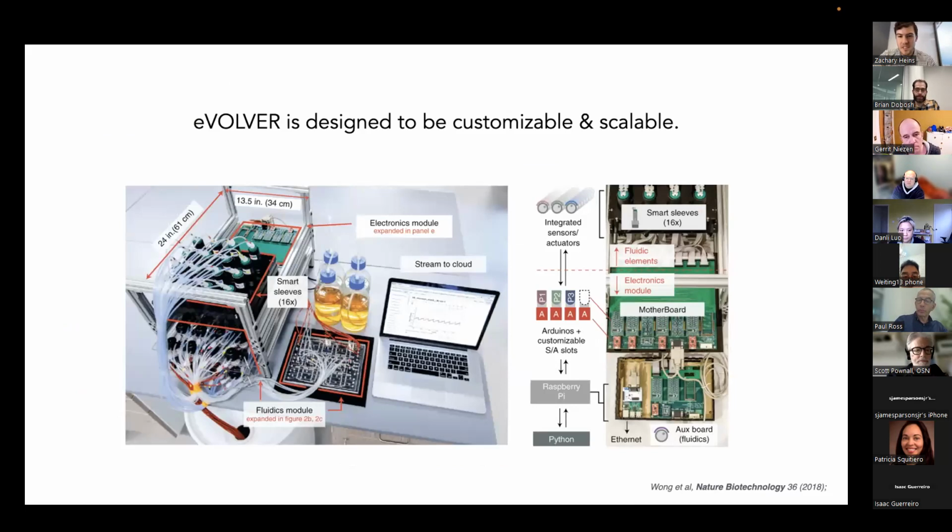So you can see, for the fan example, there's a slot on the motherboard. On the far left, there's that red Arduino. There's a multiplexing PWM circuit there that can then send off your PWM signal for each vial through this PWM chip. Temperature is the same way.